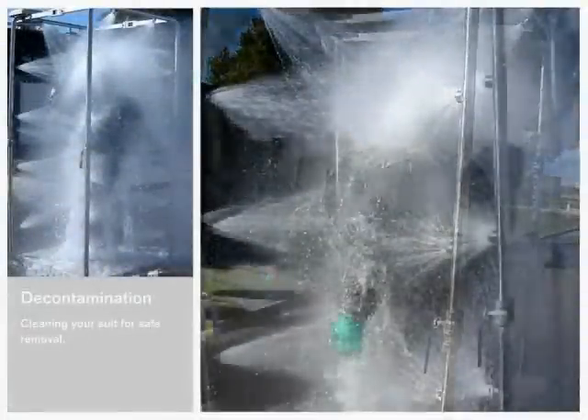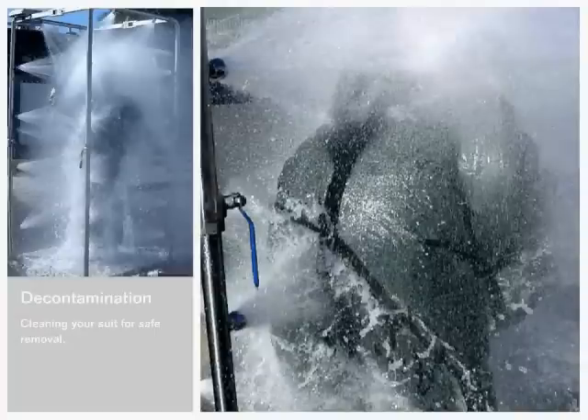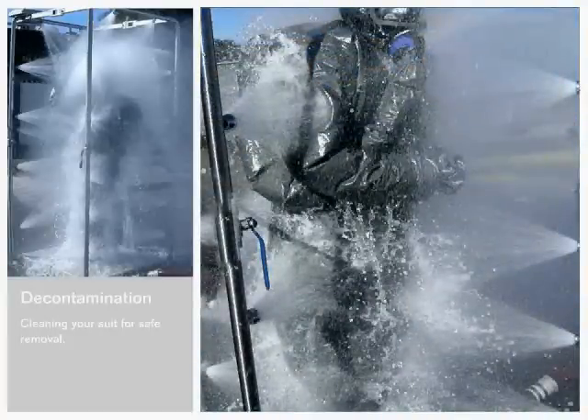Decontamination after you finish is as crucial as preparation before you begin. The SE Shield system is built to withstand very rough decontamination methods. The one shown here uses 3000 liters of water in 3 minutes.